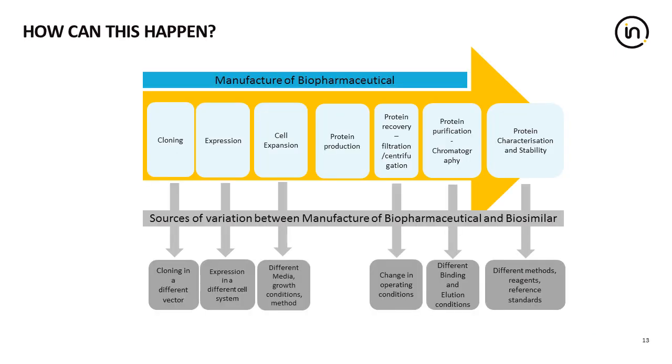So I previously mentioned briefly the manufacture of a biopharmaceutical, that the protein is under a lot of stress during that entire process. And this is again a very simple representation of what might be happening. In this scenario, I've cloned the protein, expressed it, let the cells grow, induced the protein, recovered the protein using filtration or centrifugation, purified it by chromatography-based methods, and then characterized it and done stability studies on it.